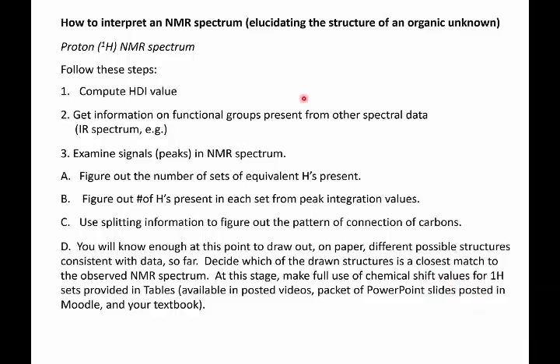Suppose you are given an organic compound whose structure is unknown. Your task is to figure out what its molecular structure is. One of the most useful tools to achieve that task is the NMR spectrum of the compound.